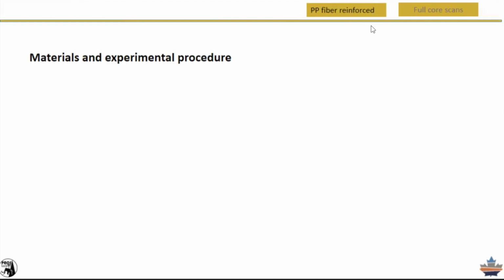The next part is about the unfrozen samples. I brought this here because we had great progress in doing the porosity analysis of some fiber reinforced clay soils, which can be of interest for any projects. The porosity analysis is a very significant tool for finding out the effect of lots of things: treatments, curing time, climate conditions, freeze-thaw cycles, and the microstructure of the samples.